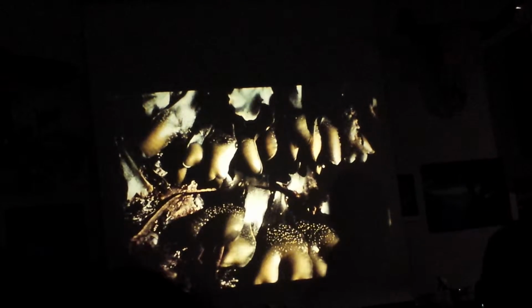What genus? No, if it's brown, it's Phaeophyta. See the swollen tips to the end? Little branches on them? That's Fucus. So this would be a receptacle here.